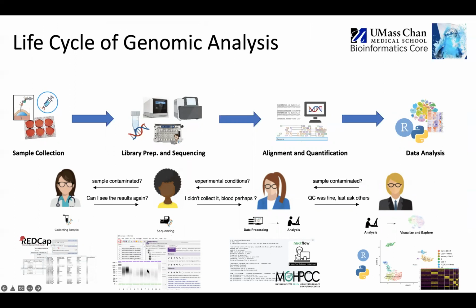Or you send your sequences to a sequencing facility, they're sequencing your runs, and there is lots of other information coming from there. If there's a problem, these people need to be in communication, and these people need to actually know who these people are, and all the information needs to be entered into a single place.